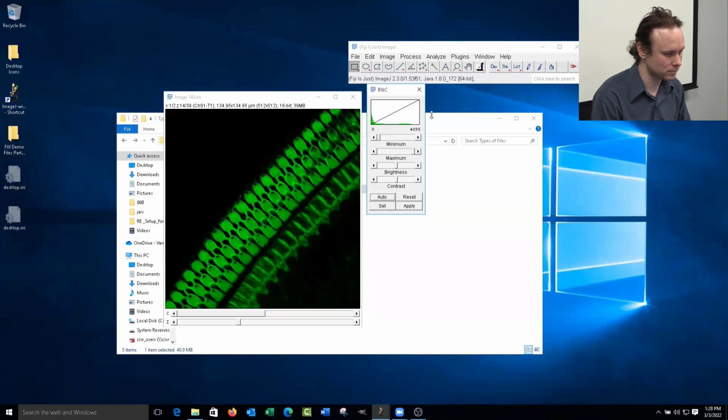Yeah, so to expand on that just a little bit, I'm assuming that the image you are currently using has multiple channels in it, such as 488, 568, 647. But if we save our images according to their respective channel, one image specifically for 488, one image specifically for 568, etc., then is it okay to open that original image, immediately convert from 16-bit to 8-bit, and then start the manipulation, keeping in mind that we are keeping the original TIFF file that we received from the scope? So from a data integrity perspective, that's completely fine.